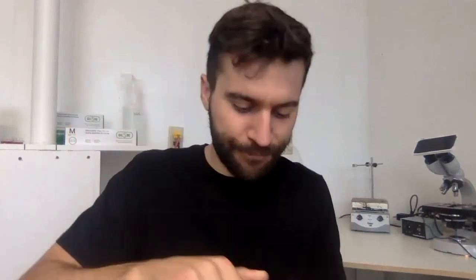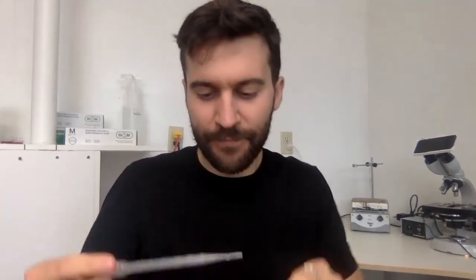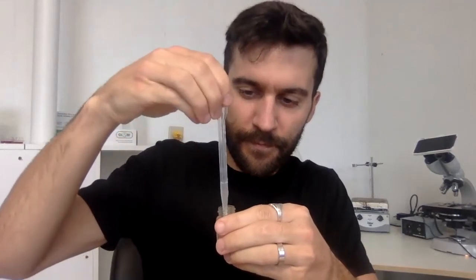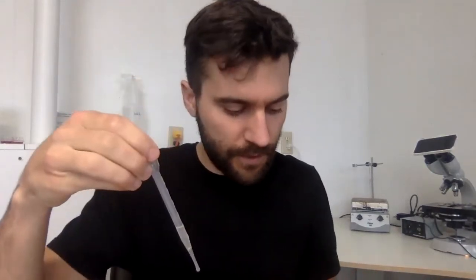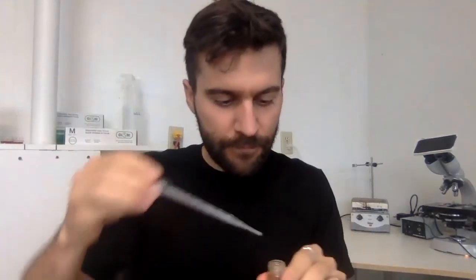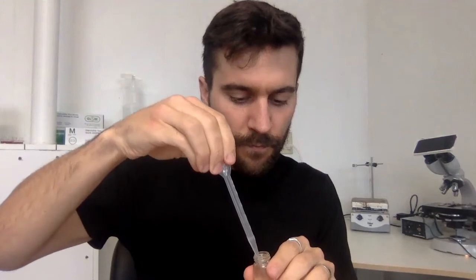Okay, shake it. Okay, last one. Mil. That's 9 mils. Let's give it a quick shake.